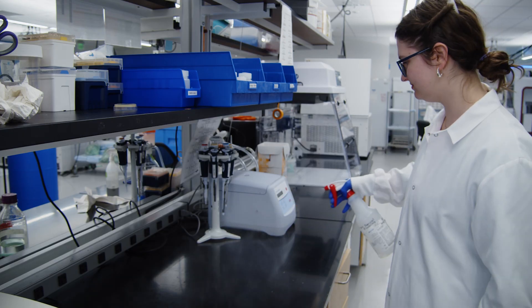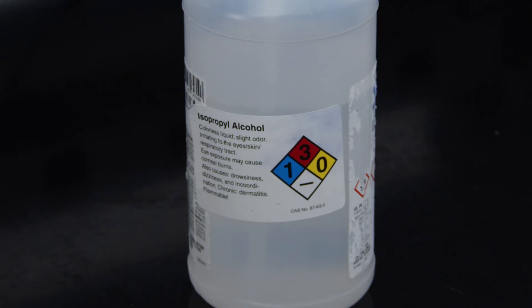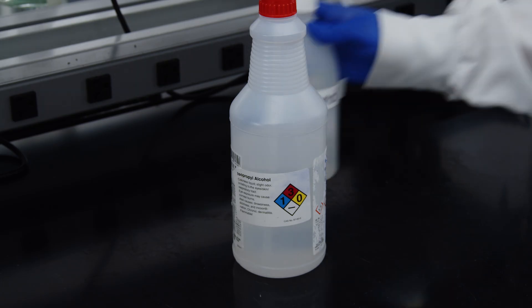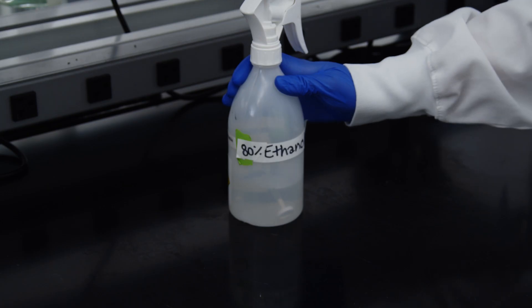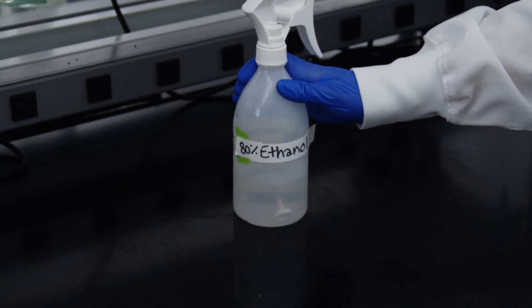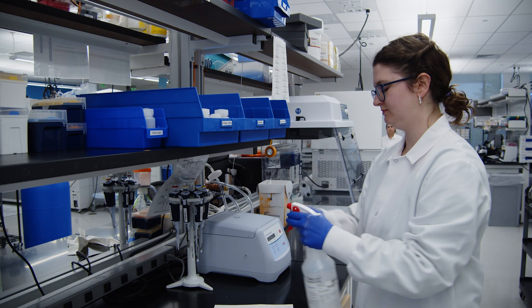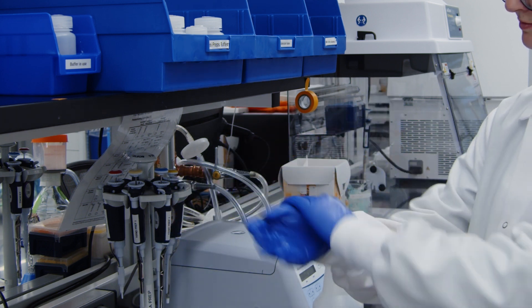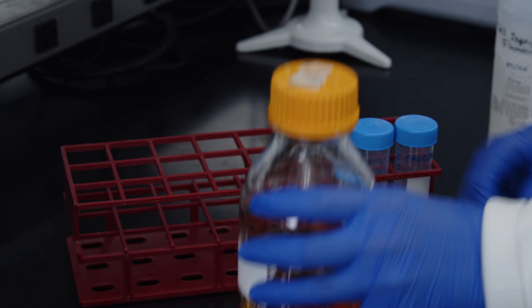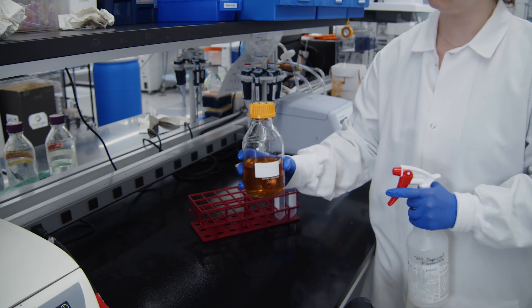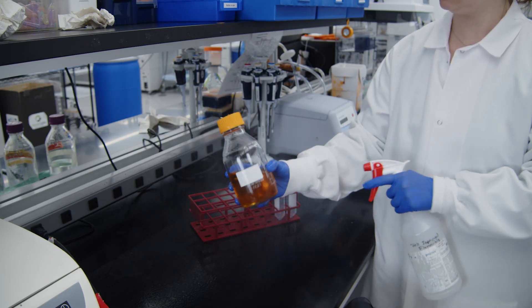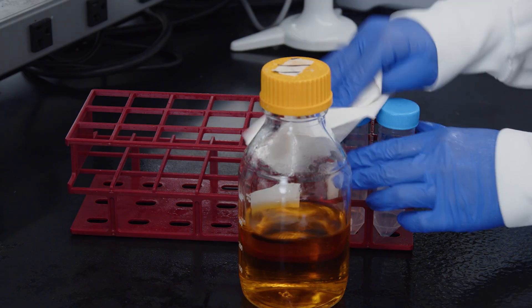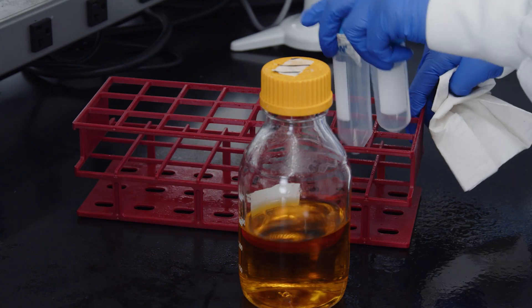Next, spray your bench down with a disinfectant. At Adgene, we use isopropanol. But many labs use ethanol slightly diluted with distilled water. It's not just your bench that needs disinfecting. Your gloves, sleeves, and any bottles or containers you're working with also need to be disinfected. Just remember to let things dry before using, so you don't accidentally add alcohol to your samples.